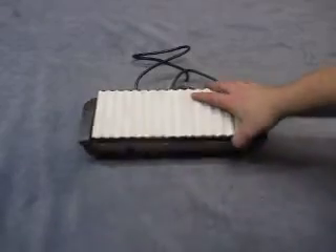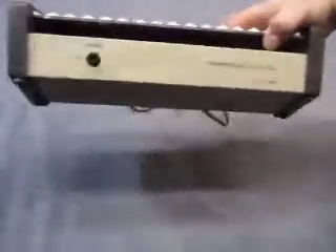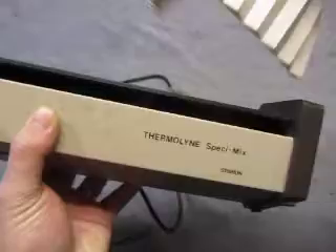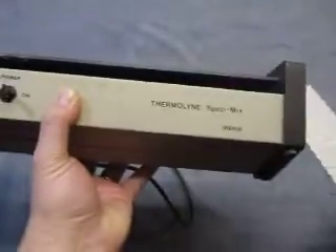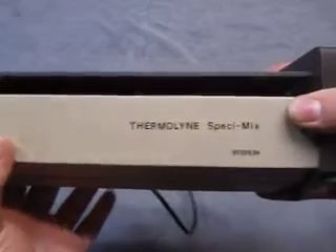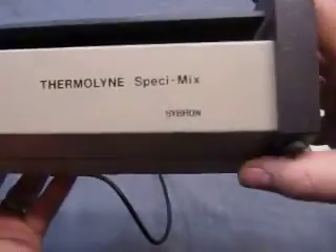For sale we have a Thermolyne Speci-Mix model M26125. It's like a rocker or something like that, I think. I'm going to get this mat here, which should be cleaned. And then you got the on/off. What it is, it's by Sybron.